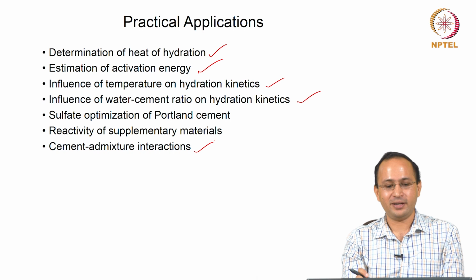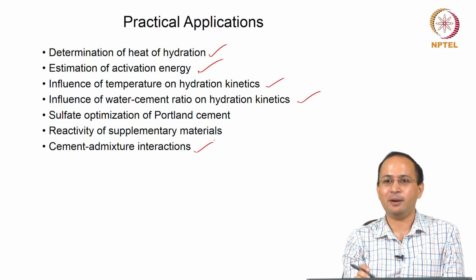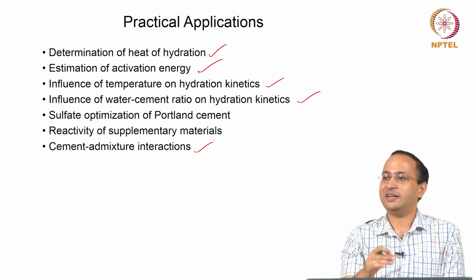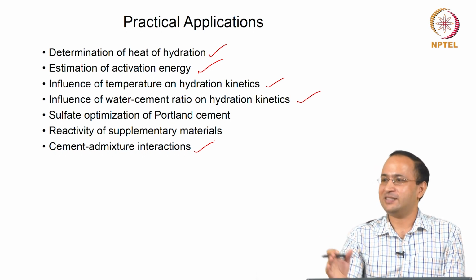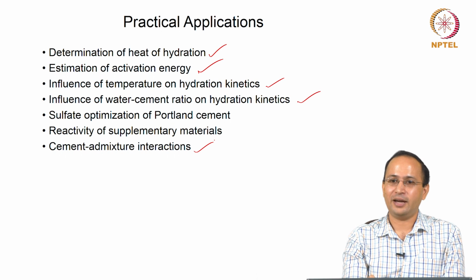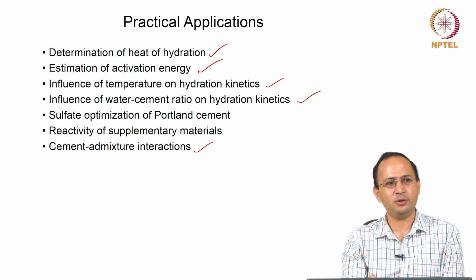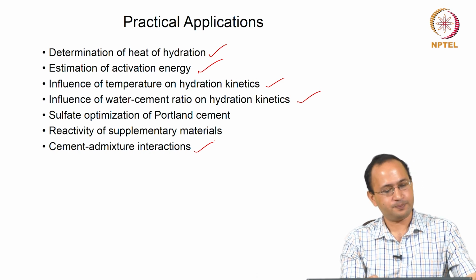What we are interested in is understanding the cement admixture interaction. If you use a particular admixture, does it delay your setting? Does it accelerate your setting? What is the influence on the main heat, main hydration? These things we want to understand. So, this technique can be used to examine those interactions.